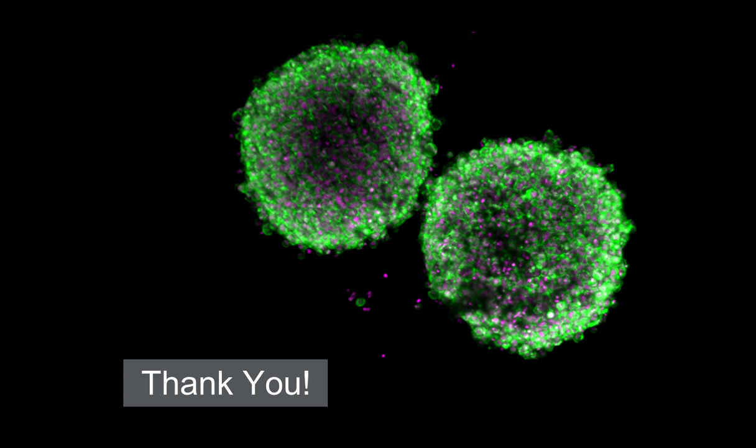Yeah, thanks, Christy. Another good question, where all of the different assays and reagents and dyes that we've discussed are things that we'll need to add to our cells, and in many cases we'll need to wash our cells, or in some cases fix and perm. These are all things that require media changes and manipulating our cells.